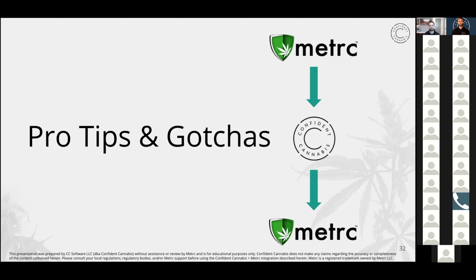So now we're going to go into our pro tips and gotchas. So basically the pro tips are things that you should be doing and best practices. The gotchas are things that you should keep in mind and look out for and how to solve them.